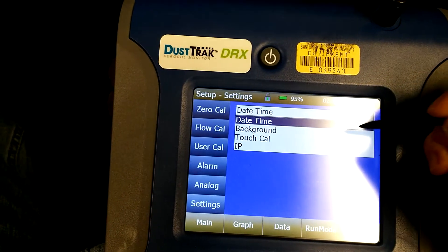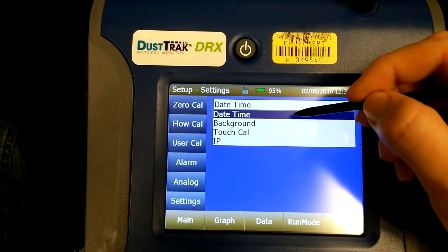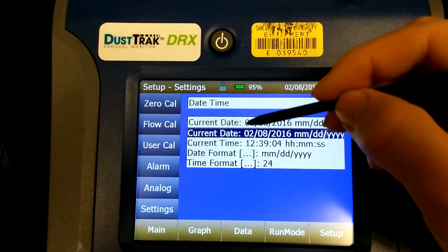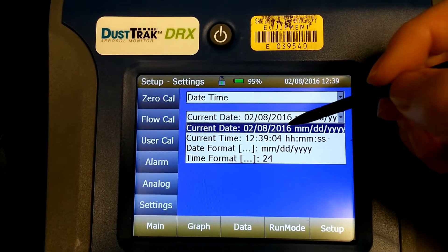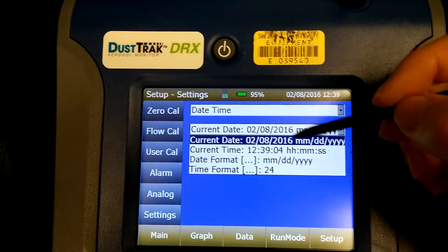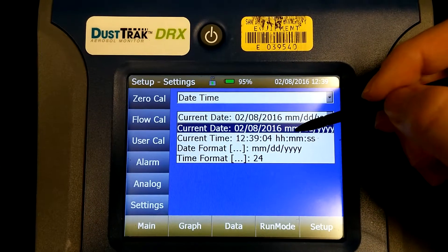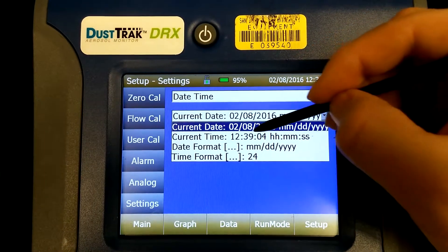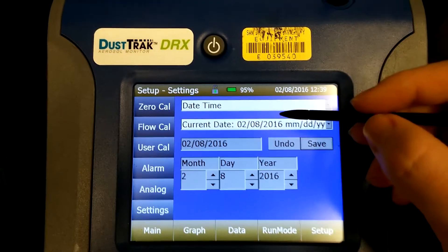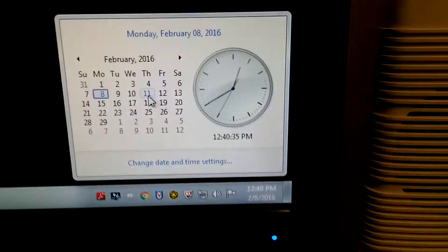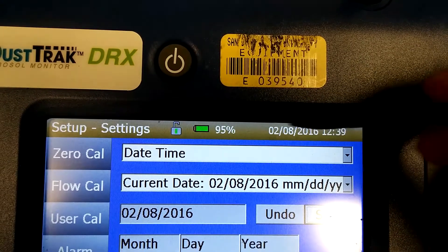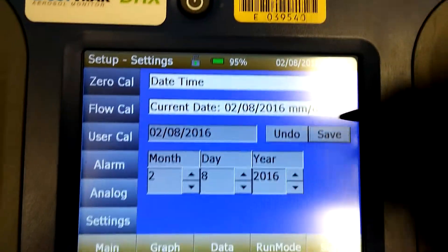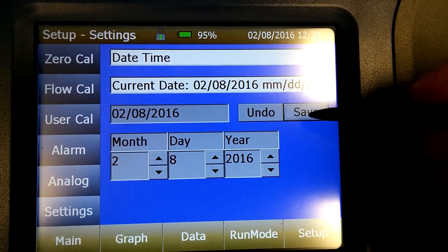You can click anywhere on the highlighted area to select Date and Time. The highlighted portion is what you see up top, so you can click the highlighted portion again. To set the date, click the highlighted portion where it says 'Current Date.' The date shown is Monday the 8th, February 2016 — February 8th, 2016, which is correct. You can hit Save and move on.